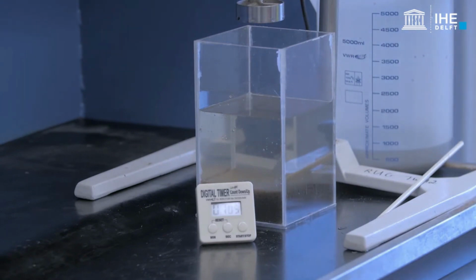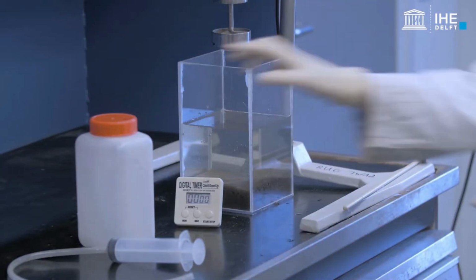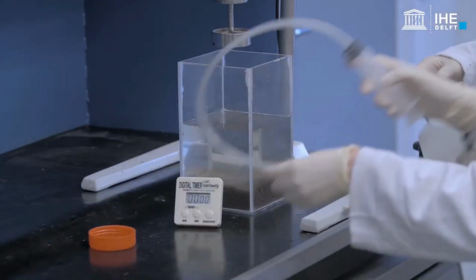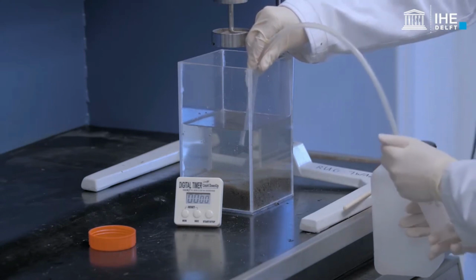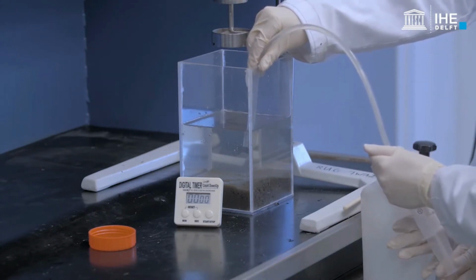After 30 minutes of settling, the DSS of the supernatant is analysed. Place the siphon into the supernatant. Make sure that sampling does not disturb the settled sludge. Gently pull the syringe.